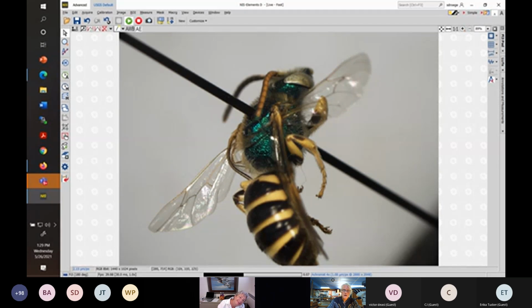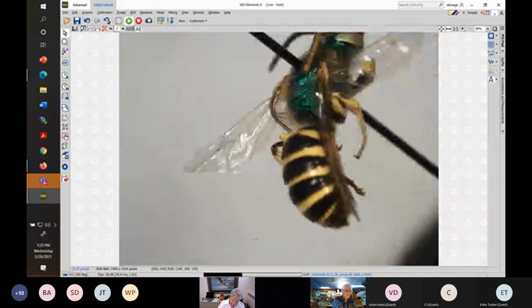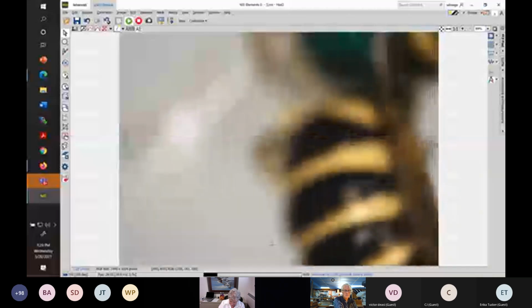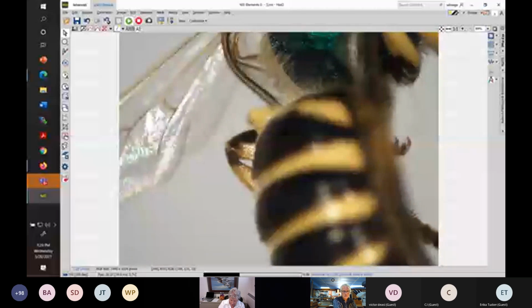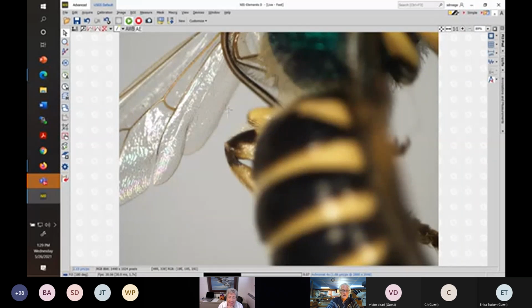But importantly, it's got its hind wings sticking out, and its forewings are somewhere else. So we're going to use this bad boy as a model for learning about hind wings. And we'll also talk about why people rarely use these things. Okay, so lobes: when it talks about vanal and jugal lobe, I don't know the derivation of the names. This is the jugal lobe. You can kind of see it vaguely here. It's basically just a lobe without any veins associated with it, although sometimes there's veins leading to it. And here's the vanal lobe.